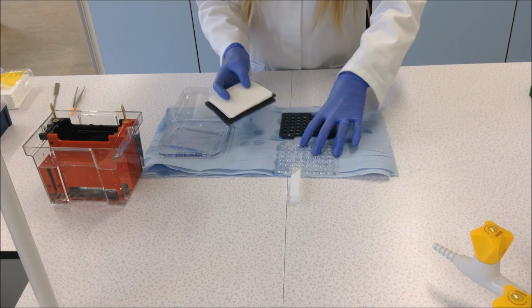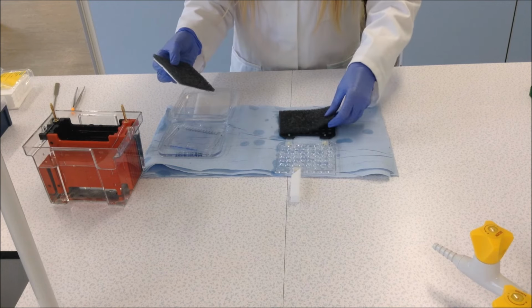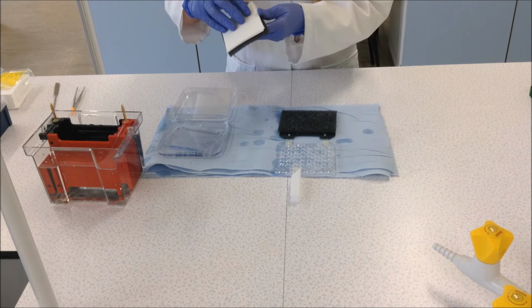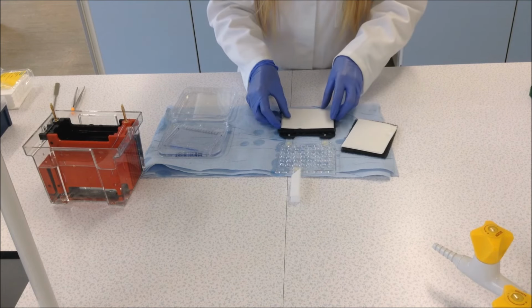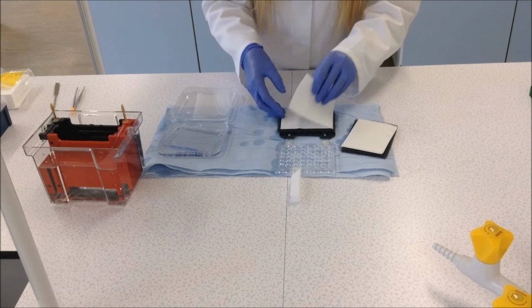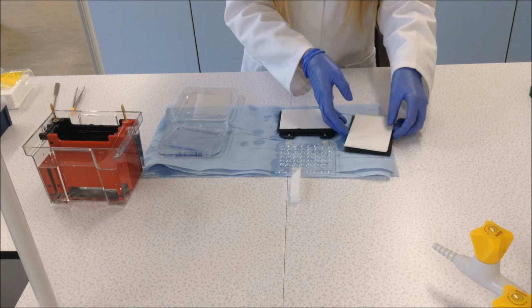So when assembling the blotting module, we always place things on the black side first. To begin with, we place one of the sponges down, followed by two of our pieces of blotting paper. We must also ensure that the two pieces of blotting paper line up, as any lumps and bumps could interfere with the blotting process.